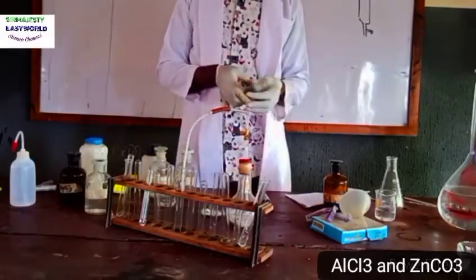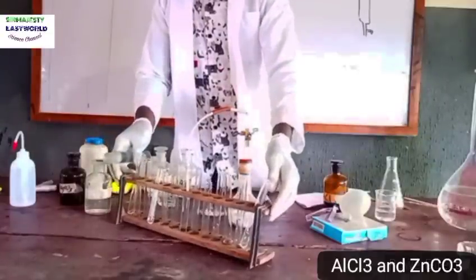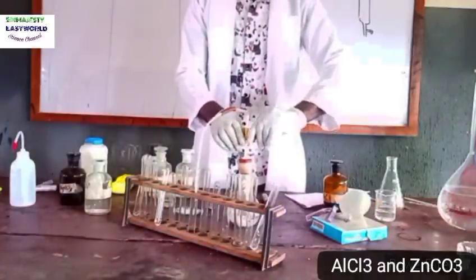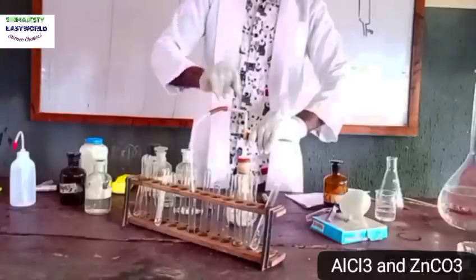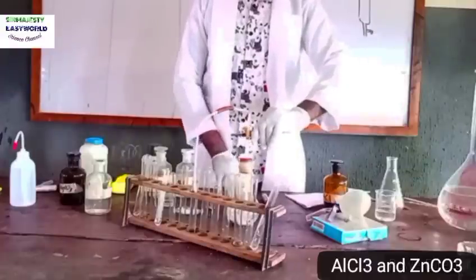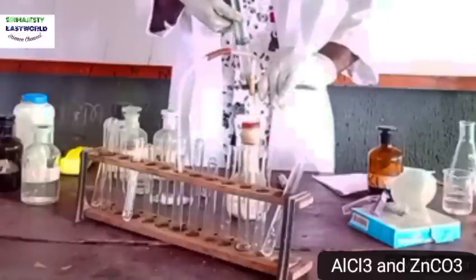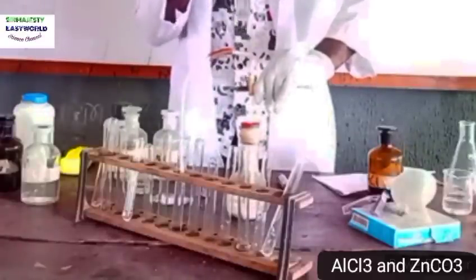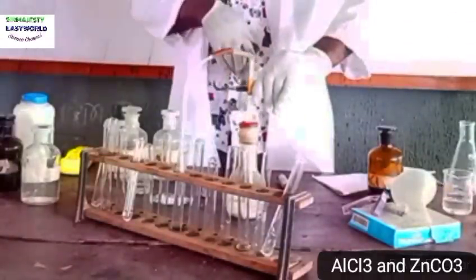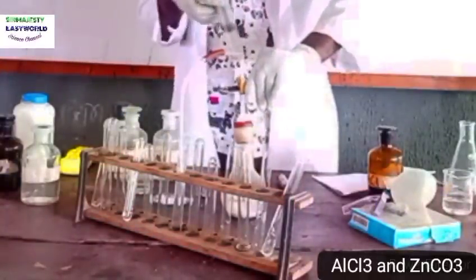Okay. So over here, I don't know how to place this so that everything will be visible in the camera. So, dilute HCl, if I introduce it, see there are bubbles, that is the CO2 being bubbled into the lime water. You see, gradually it is turning milky, the lime water is turning milky.